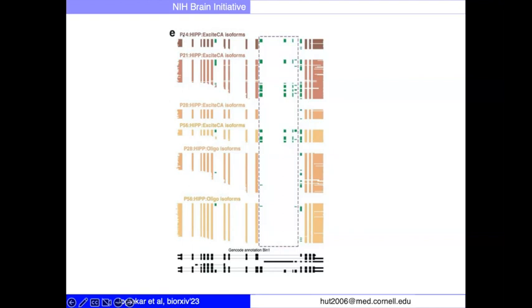And so now here's the same gene plotted a little bit differently, and so we have here excitatory neurons at P14, P21, P28, P56, all in the hippocampus, and then just as a comparator, the oligodendrocytes. And you see that there is a lot of exon inclusion in the neurons. However, we already see that here at P28, for example, a lot of skipping occurs, and we thought these were completely glial isoforms. And I will come back to this in a little bit.